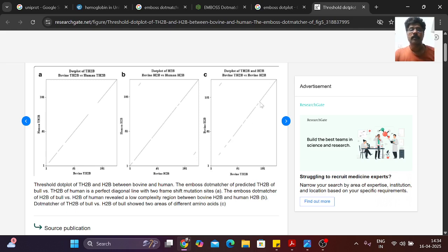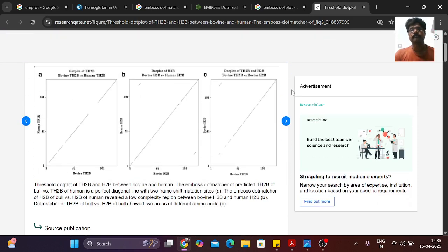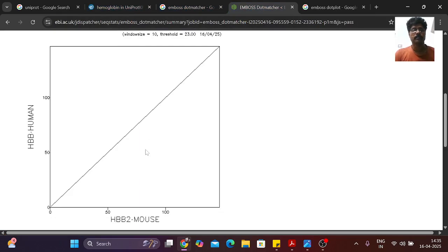I hope you understand; if you do not understand, just leave it. We will see it in another software. I can explain it using a graph with bases here. We will take a simple example using a short length and I will explain to you. Okay, so this is how you can discuss the result whatever you get for your sample, right?